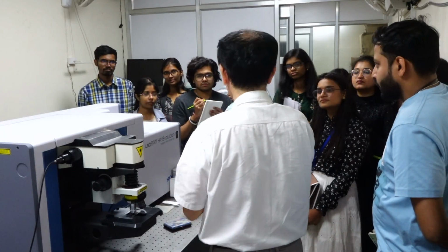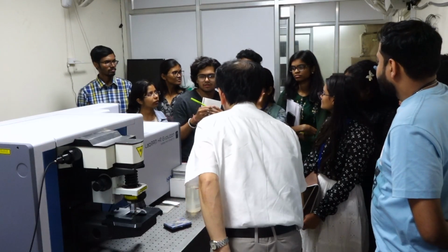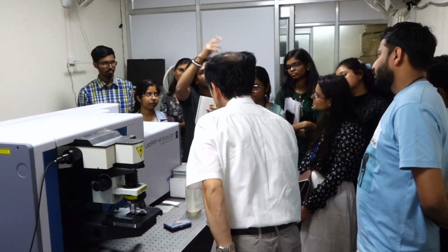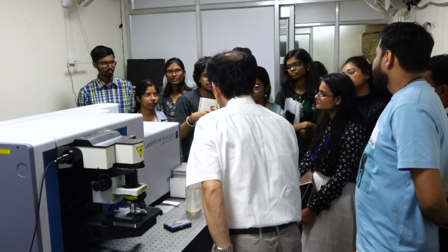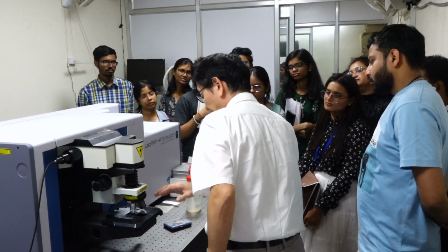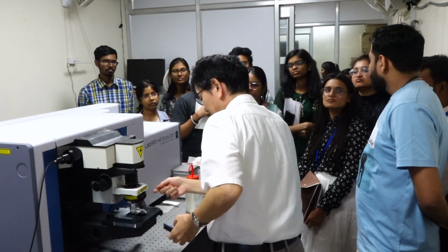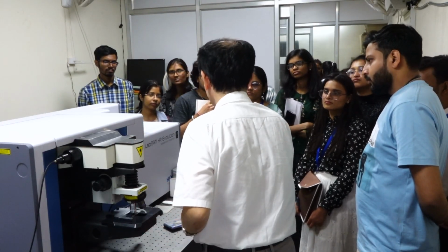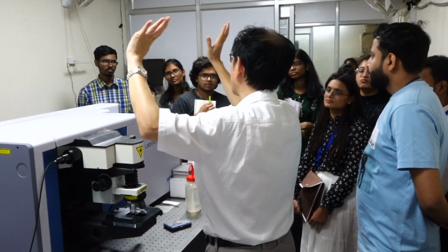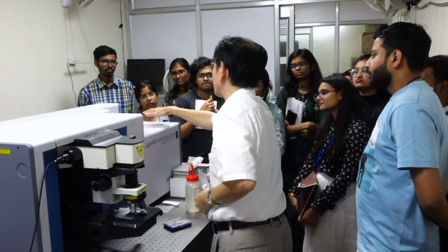Is there any question? Sir, is it open like this? What about this light? It can also be captured, right? Oh, you mean if the room is bright, some light comes from this lens? Yes, exactly. So usually we should turn off all the lights. Otherwise it becomes stray light and gives some unnecessary background.